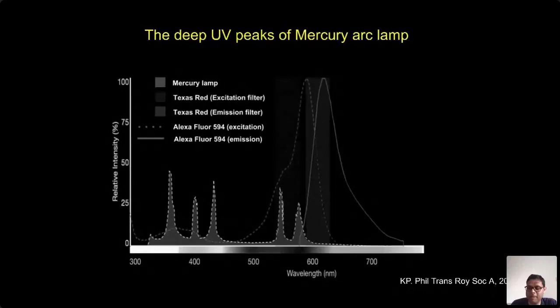Except for microtubules and the synaptonemal complex, even at nanoscale their organization might change. So we don't know if these ends are joining in a STED and SIM image for sure. So there has to be a bigger focus on correlative light microscopy, so that you can see the same imaging conditions, same labeling with STED, SIM, and this.